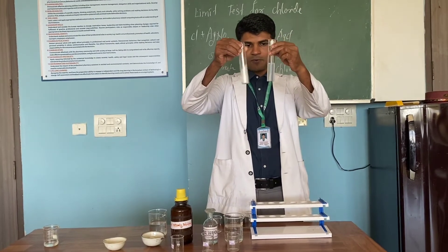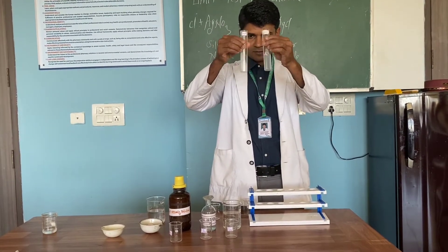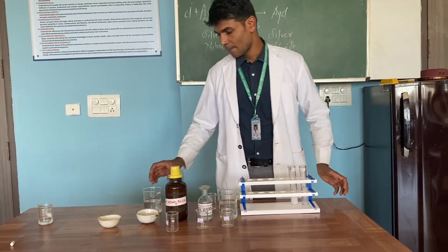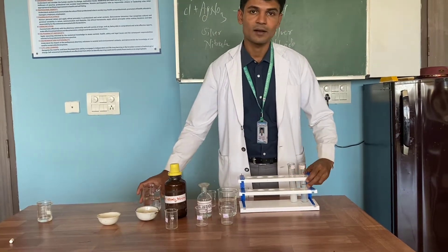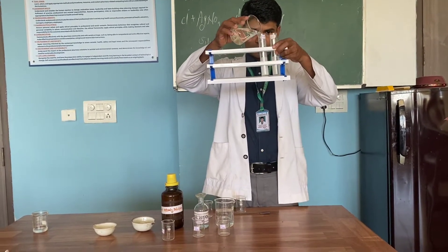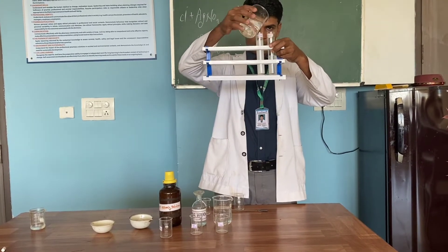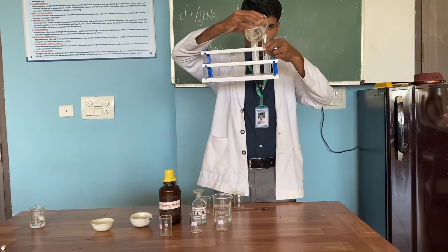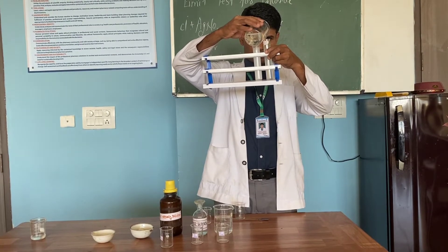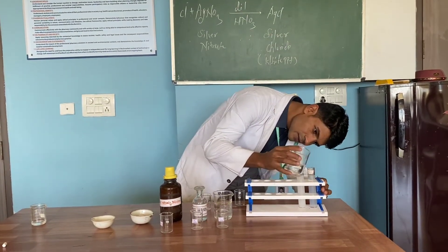You can see there is a turbidity forming. This is the standard one and this is the sample one. After adding AgNO3, by using water we have to make up the volume. I will add water here to make up the volume till 50 ml, and then adjust it.